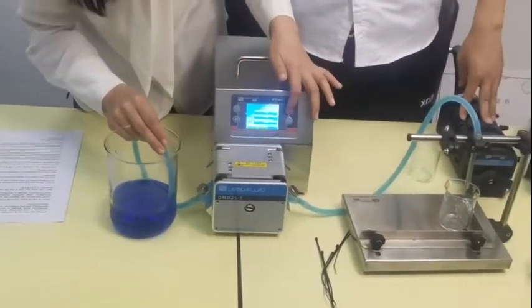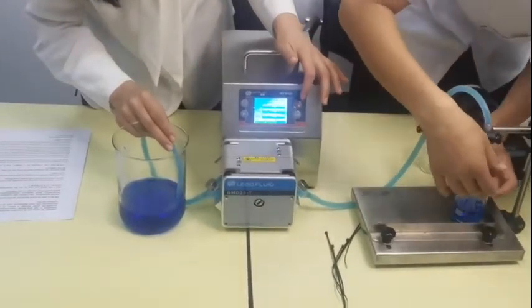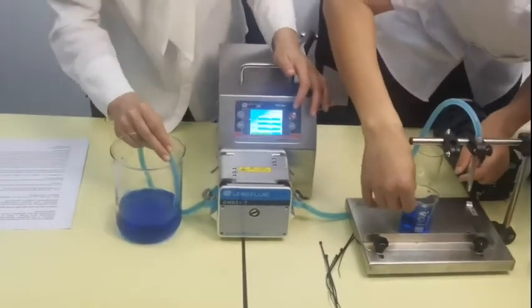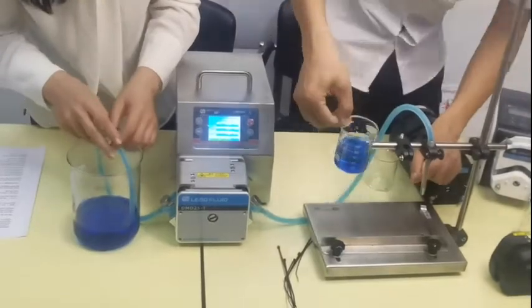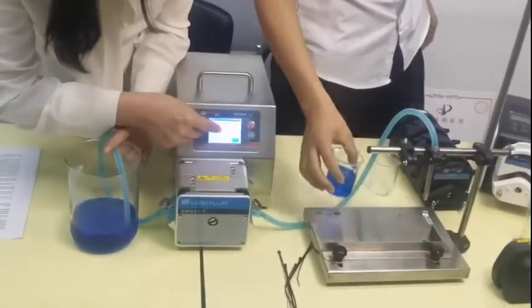Let's try the first one. This is the first one. Can you read this for us? The number is 70. 70? Yes, 70. Okay, we can put 70 in the pump.